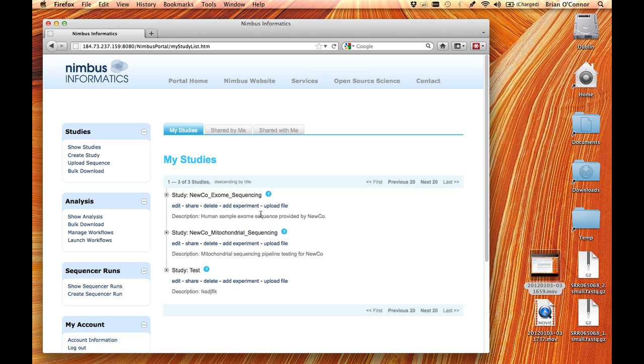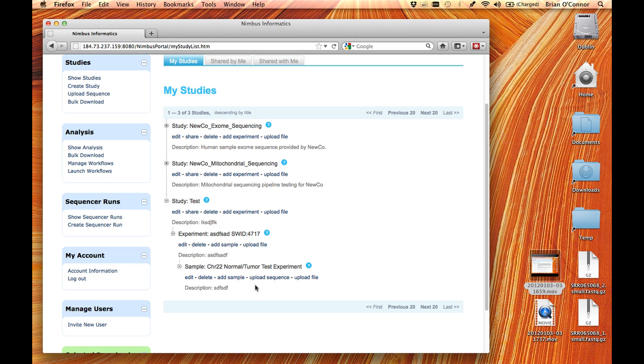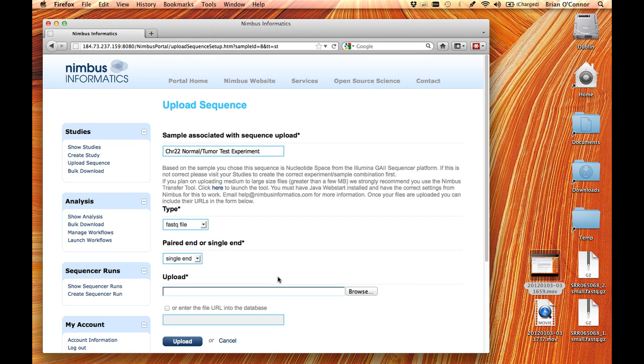Okay, in the last tutorial, I showed you how to set up a study, an experiment, and a sample. In this tutorial, we're going to pick up with uploading sequence into the cloud. Without this step, you have no data to actually process. So this is really the first step before you can really get work done.